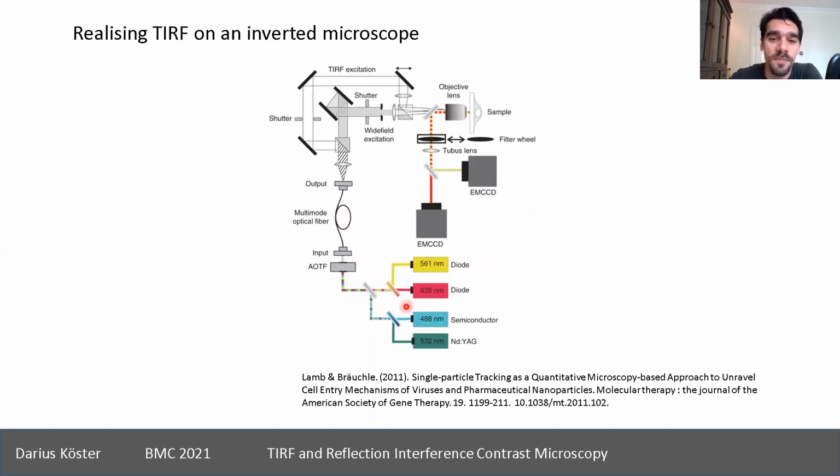So first, we often use lasers, so they're very useful, of course. So we have a laser light source. In this case, they have a laser combiner. Of course, you want to have different colors as an option. Then the important part is that you have these mirrors from the side, to steer. Where is it here actually? Okay, there it is.